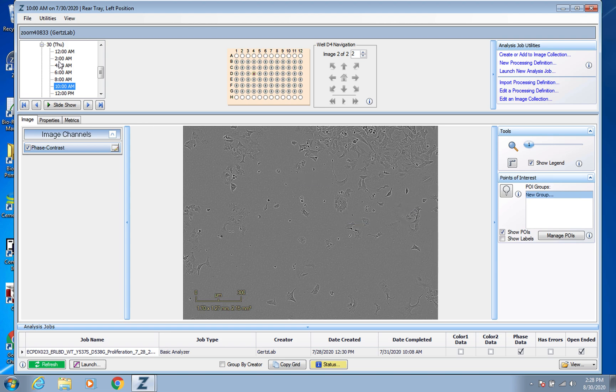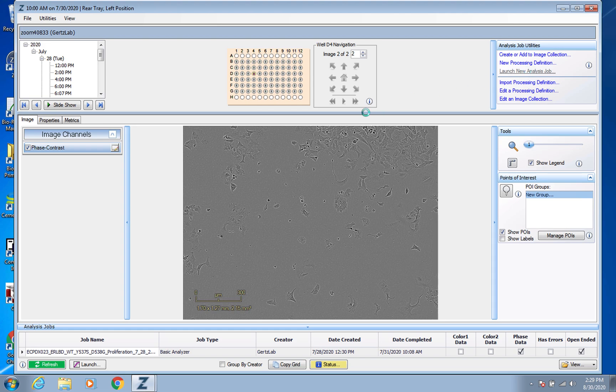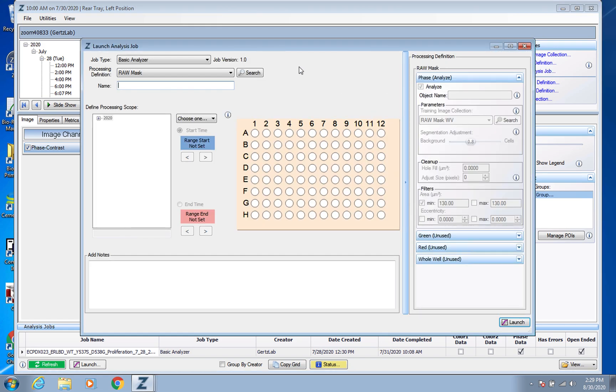But what you really want of course is the actual confluence data. So if you hadn't run an analysis job when you first set the scan to be running, you could just go to this top right and click Launch New Analysis Job.